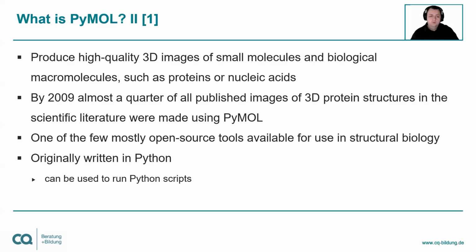It's one of the few mostly open source tools available for use in structural biology, and it was originally written in Python and therefore can still be used to run Python scripts, for example, for measurements or more complex calculations.